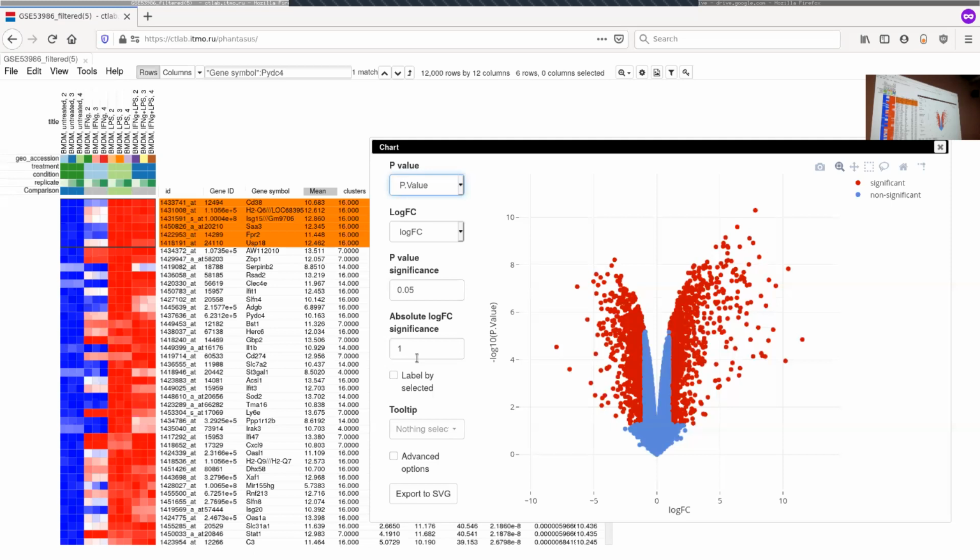However, also usually, in this volcano plot, you can see that there are two thresholds: one for log change and one for p-value. So basically, if you have a significant p-value but low log change, it's probably statistically significant, but not that biologically significant. And again, it can have a high log change but not be statistically significant. That probably is also not significant.